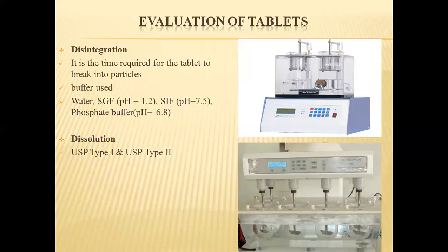In case one or two tablets fail to disintegrate completely, then we have to repeat the test by taking an additional 12 tablets. The tablet passes the test if not less than 16 of the total of 18 tablets tested have disintegrated.